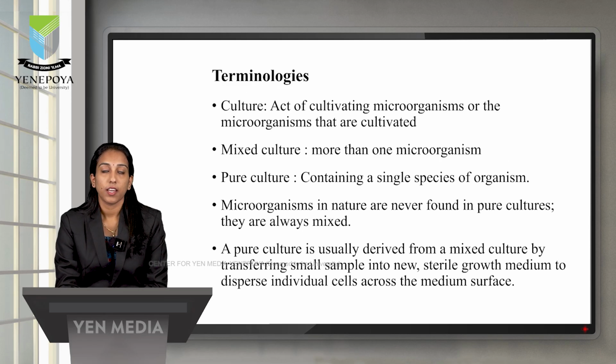Before going to the isolation and preservation, first we need to know what a culture is, and the difference between mixed culture and pure culture. Culture means the act of cultivating a microorganism, that is culturing, and the microorganism that we are cultivating we can also call a culture. Mixed culture means, from the name itself, more than one microorganism will be there. Pure culture means it will have only a single species of organism.